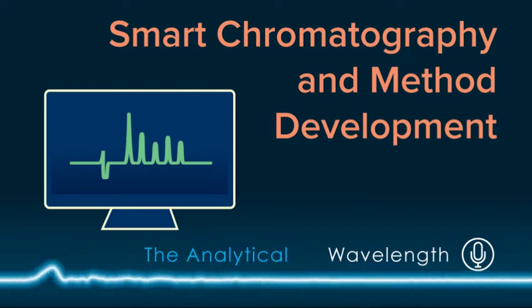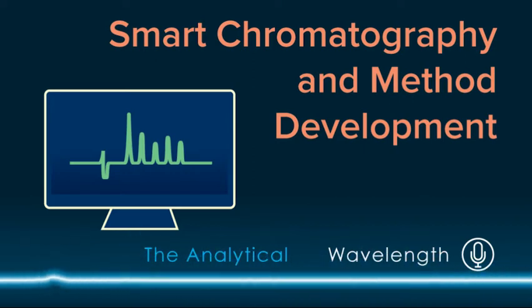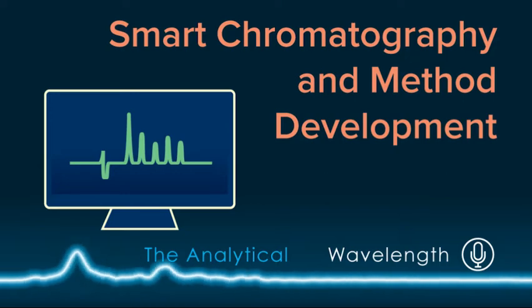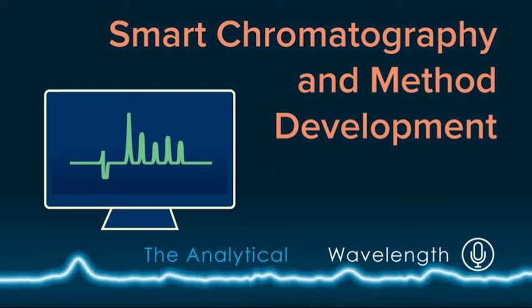And I jumped in feet first, realizing that, hey, this is probably an opportunity to make my life a whole lot easier. Spent a couple weeks scouting columns, spent a couple weeks optimizing mobile phases. And very quickly, within about 3 weeks, I was able to spin up modifying an HPLC stack to include a single quad to allow me to do some peak tracking, as well as a diode array detector, getting an 8-column compartment in to allow me to actively test different columns.